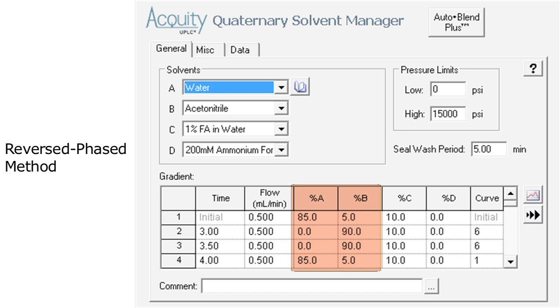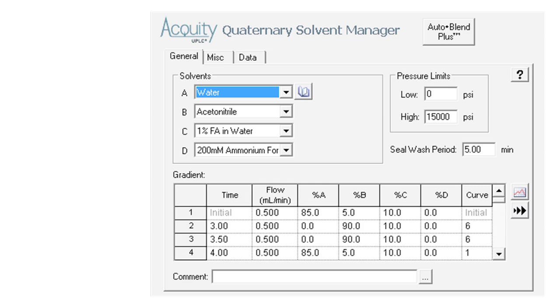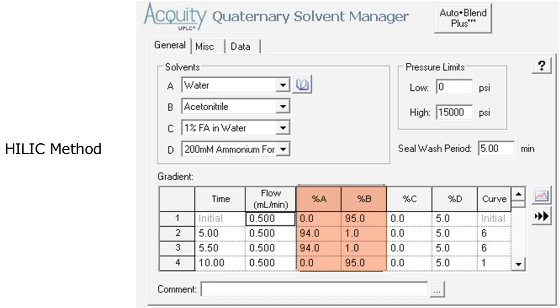This is the reverse phase method. It uses a gradient from reservoir A to B while drawing modifier from C. And this is the HILIC method. It uses a gradient from reservoir B to A while drawing the modifier from D.